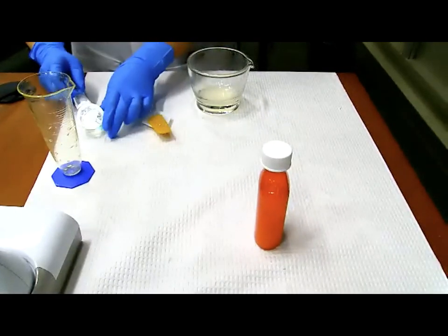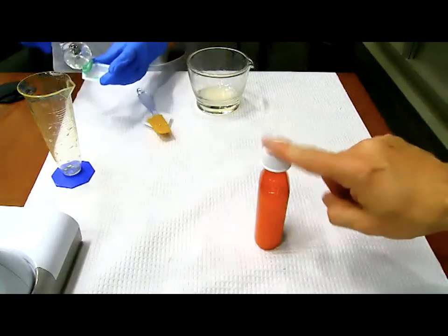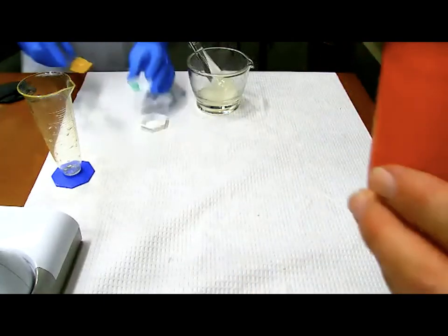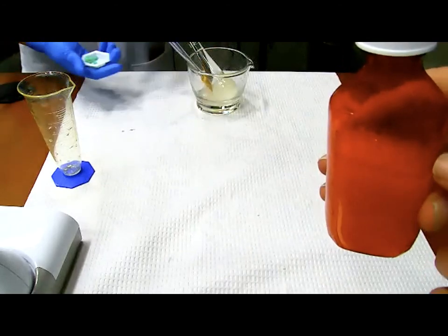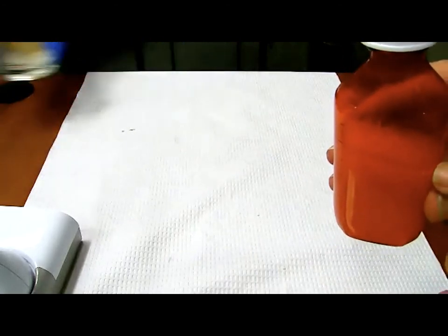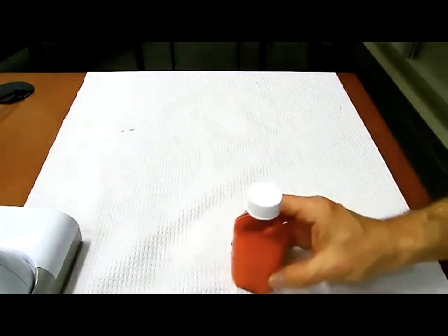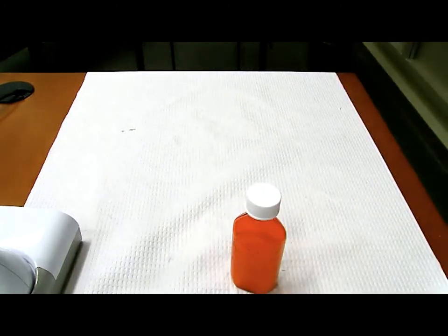Thank you. So we're going to proceed and we're going to have to do the QA for this. What you would do for the QA is double check the volume. You want to make sure that in this case it reads 80 milliliters, and it does. And now we're going to have to describe this product. So give me a second here and we will try to describe what it looks like.